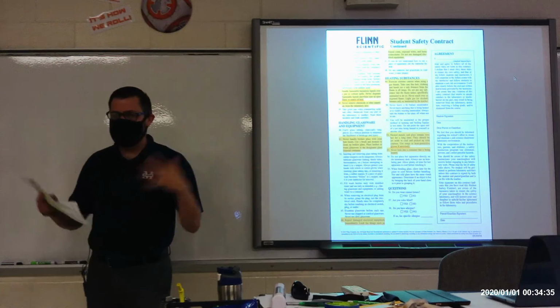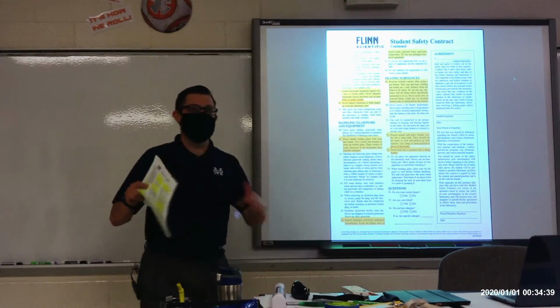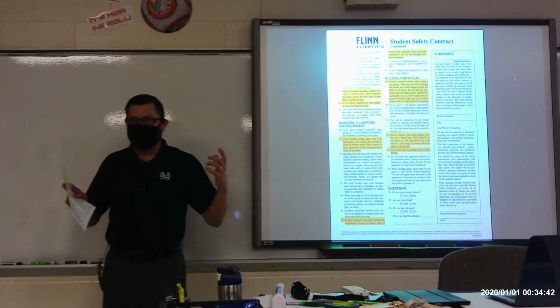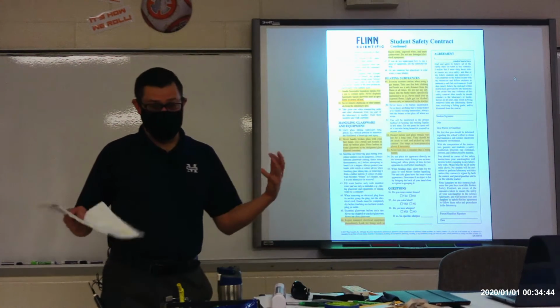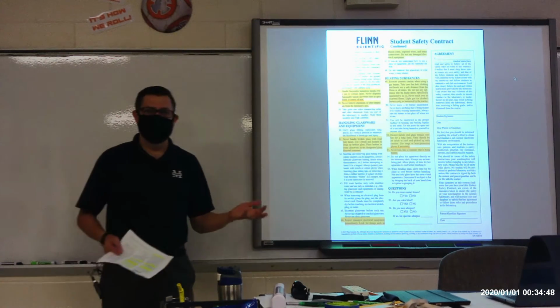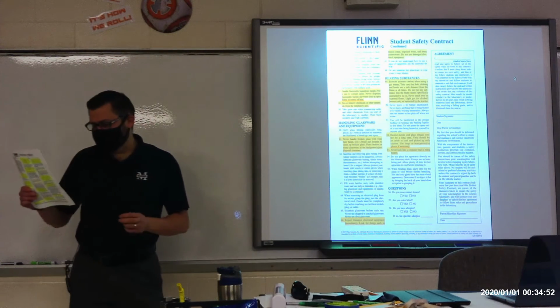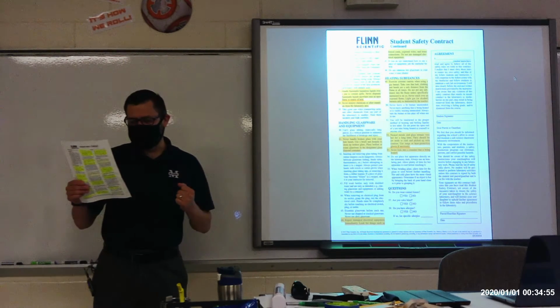So obviously anything that's in the lab needs to stay in the lab unless I say, hey, you can take this with you. And if you're asking, can I take the frog stomach or the frog brain or a worm with me? No, the answer will be no. All right, the next section, handling glassware and equipment.